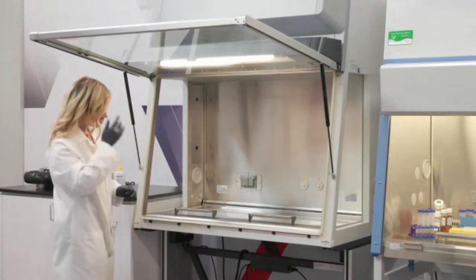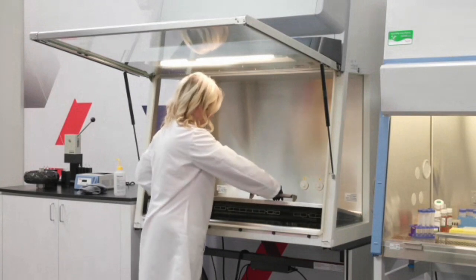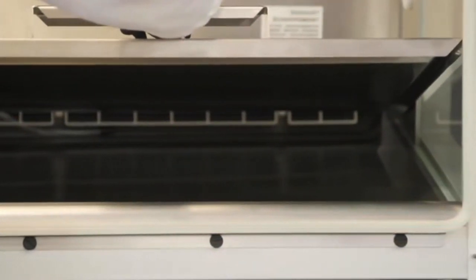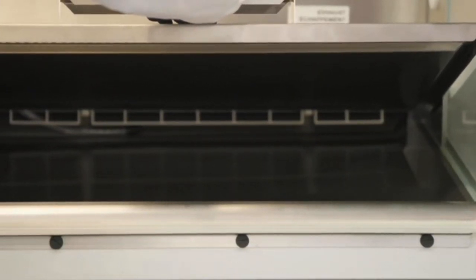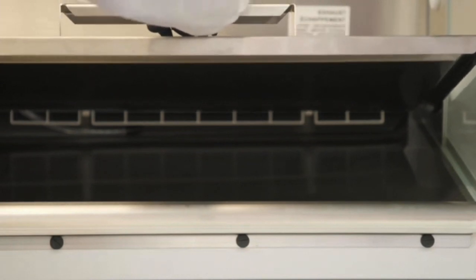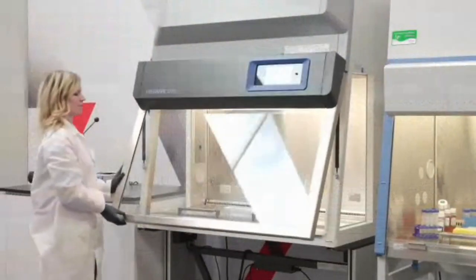Megan is now going to show us how you lift up the work surface. You can see the armrest at the front; she's lifting up the work surface to show the underneath. You would clean underneath there, and you can also see the paper catch at the back of the BSC — just make sure nothing has been sucked up into that area. Then she cleans underneath there as well.